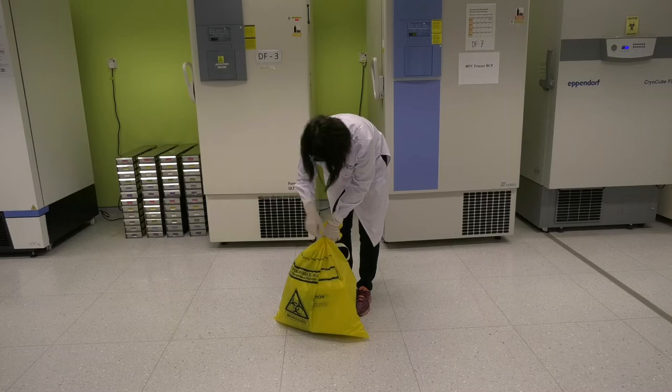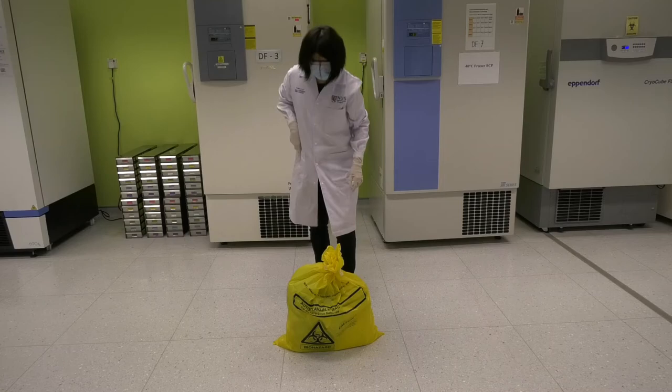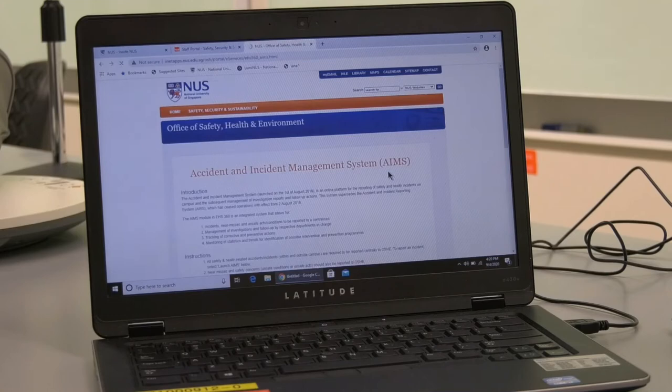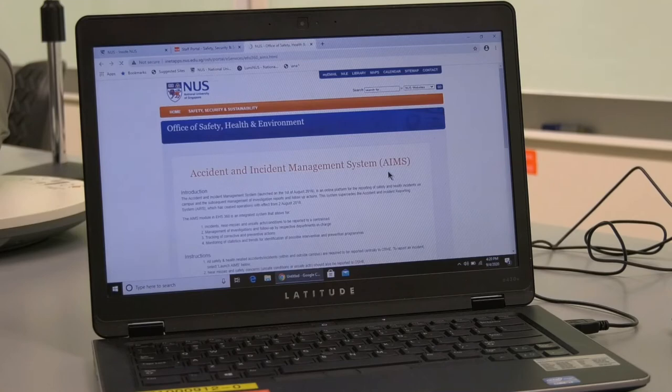Seal the double biohazard bags with masking tape and label them with the laboratory and PI name. The biohazard bags will be collected by a licensed contractor. Report the incident via AIMS within 24 hours. Finally, replenish the spill kit.